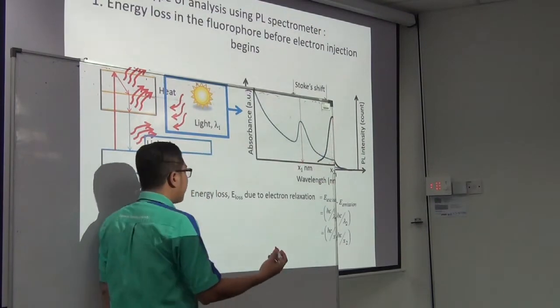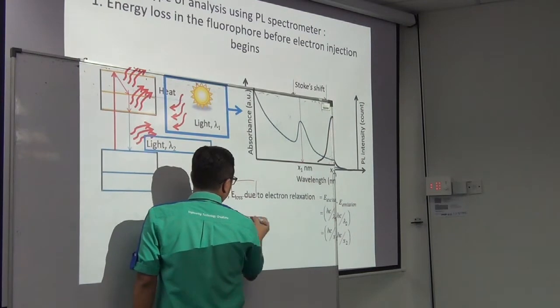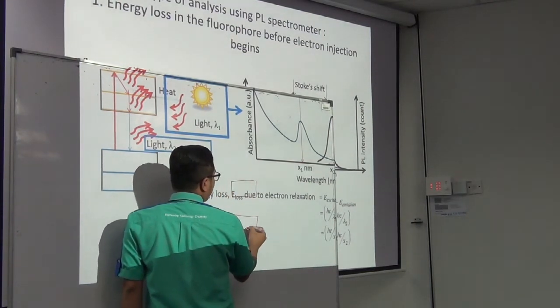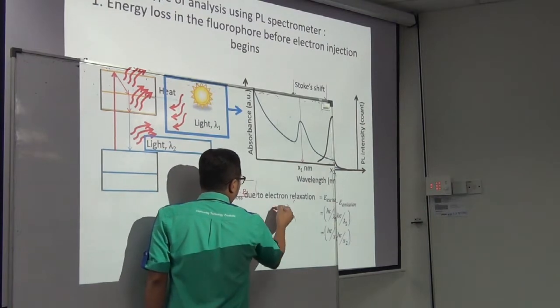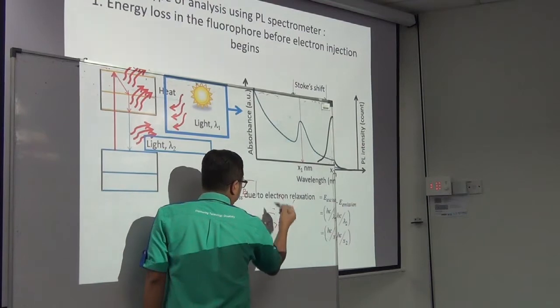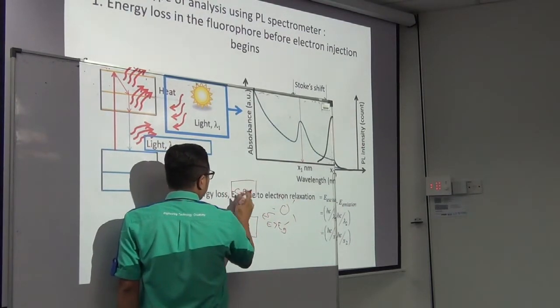You know P-N junction, you still remember? To make things easy, we just use the valence band and conduction band. And we have a source of light, giving us a specific wavelength greater than the band gap. The electron will be excited here.